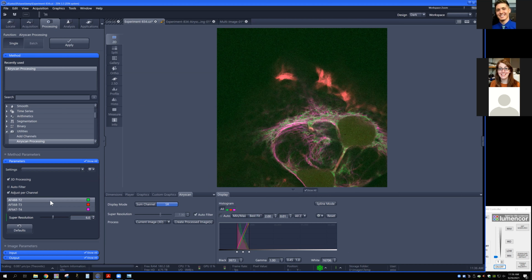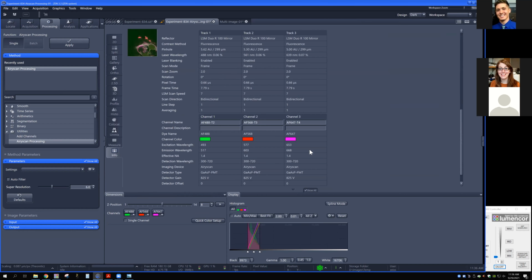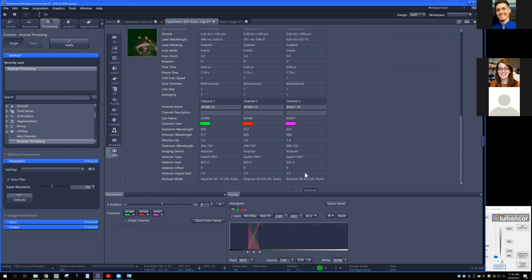So let's try doing something else, because I want to show you what it looks like if you push it too far. If you decide you want to ignore the auto setting, which often people do, the recommendation I would have is basically not to go much further than, I always like to try the auto with a couple of different images, ones that are very low signal, ones that are higher signal, and just see what kind of values you get with it.